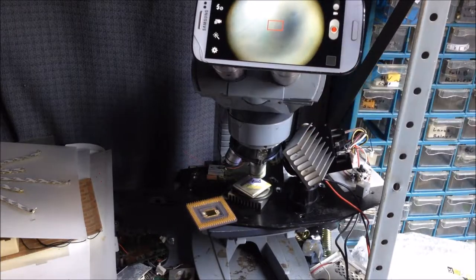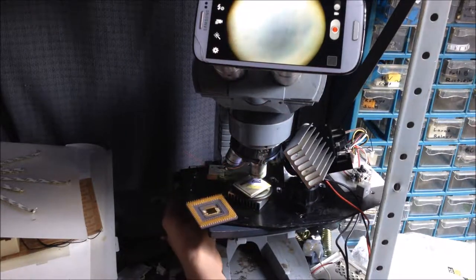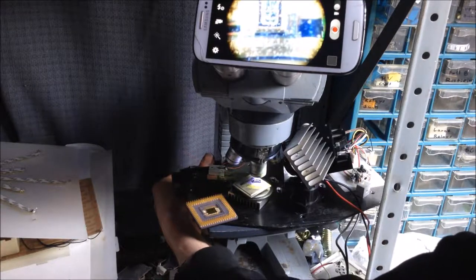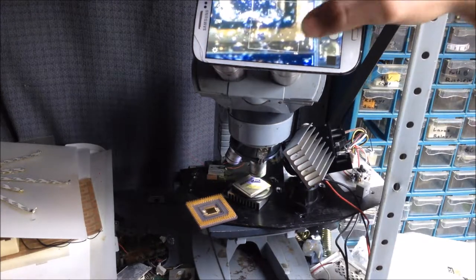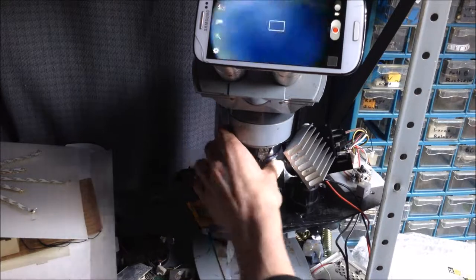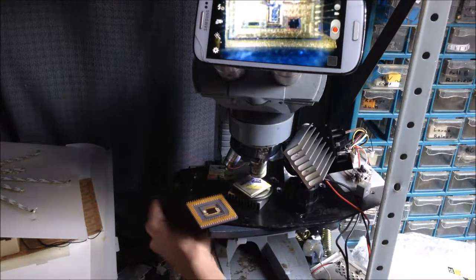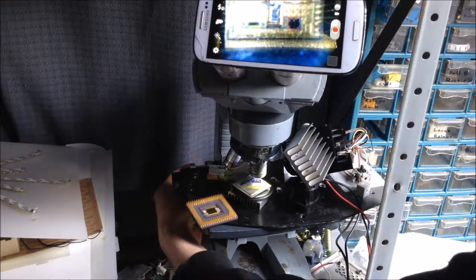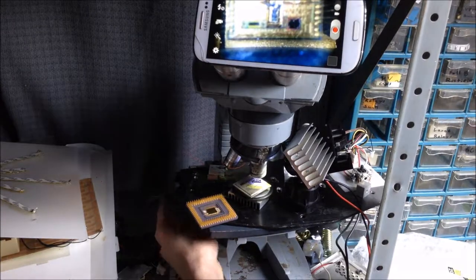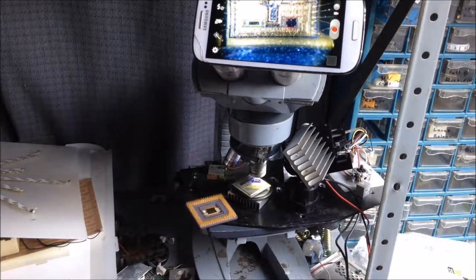Here we go. So, I want to take some video footage on this, and I want to post it up, and see how well it works, and see how you guys like it. It's just going to be one of those rough videos where I post up a bunch of different things, and talk about what's underneath the viewfinder. As you can see, I can zoom in and out, along with changing my objective focal power and moving the stage around, and then looking at things and doing the focus. The phone will do autofocus, so even if I'm a little bit out of focus, I can just tap it, and it usually focuses. Of course, it would focus there, timing is perfect on that one, but you get what I mean. So, I'm going to be doing a bunch of video shots talking about things, and hopefully it'll be a really fun video for everybody who's watching it.